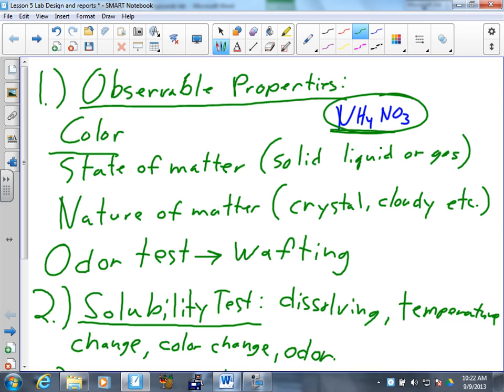If a temperature change occurs, is that thing dissolving? Yes, for sure. All right, so things like that to watch for. Are those things you should put in your procedure as things to record and watch for? Yes, okay. In your procedure, when you write the instructions for the solubility test, you don't just say add water to the substance. Add water to the material with the thermometer in place, recording the following things in your chart. Everybody follow? Okay, really important you tell them what to record.